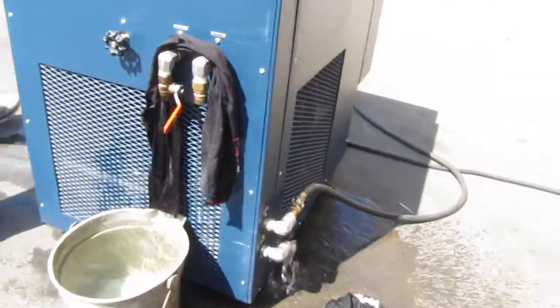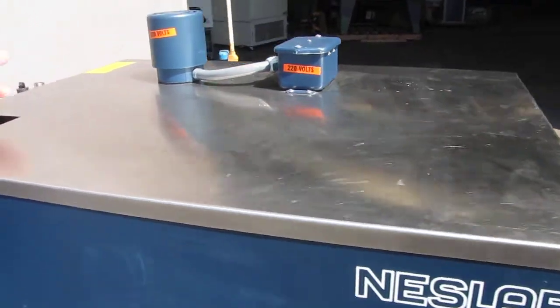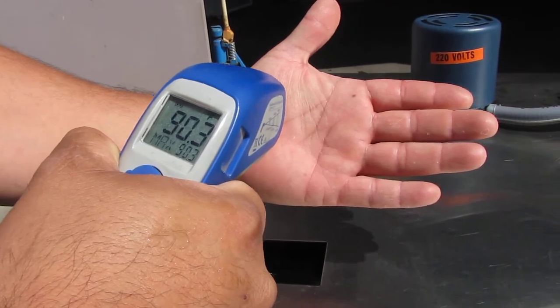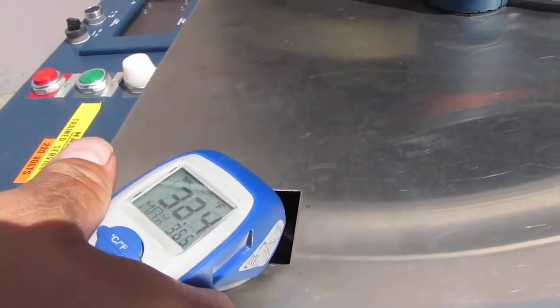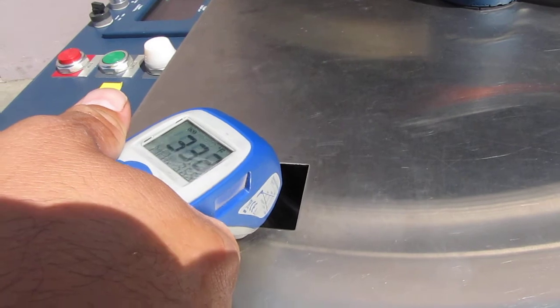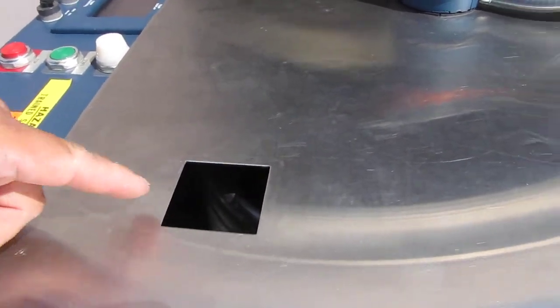Just to give you an example, we can check the temperature down there. Right now I'm at around close to 90 degrees Fahrenheit — that's my body temperature. And if we go down to the bottom, we have about 32 to 33 degrees Fahrenheit inside the tank where you have some cooling coils. You can see the condensation on those cooling coils.